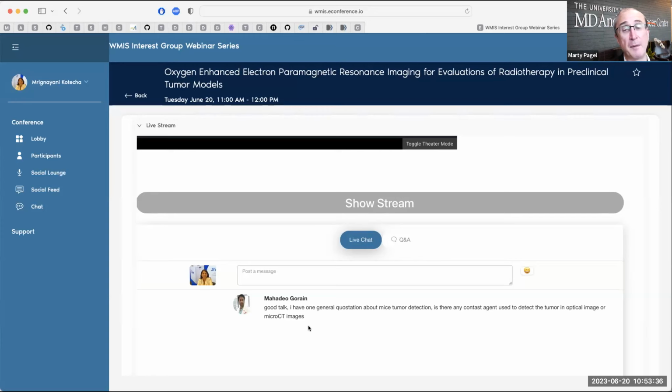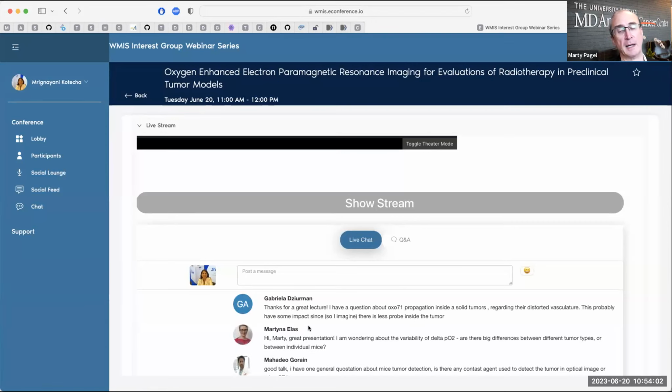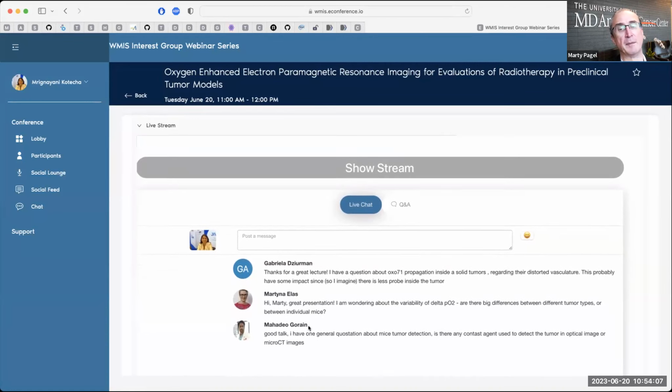Same with optical imaging, although there, optical imaging is pretty skin deep only, right? So I can't imagine how you'd get a full 3D image of the tumor using optical imaging, but if you could, and again, with fiducials, very easy to register 2 sets of images within a 0.5 millimeter resolution or error, and it'd be very easy then to find the tumor within the EPR image, just like your PET and other techniques that are used for anatomical with PET.